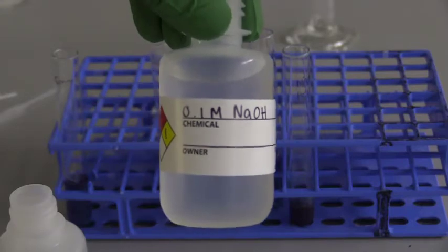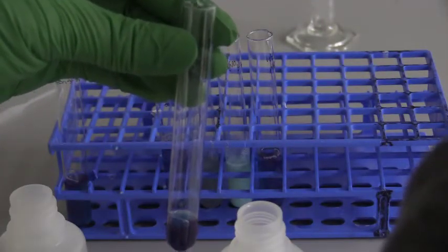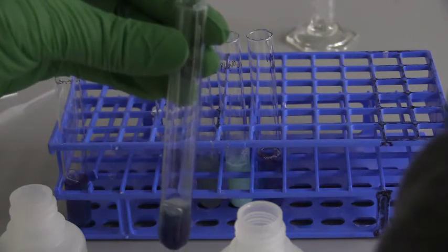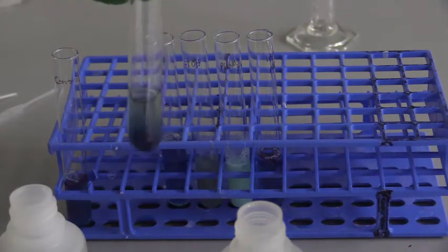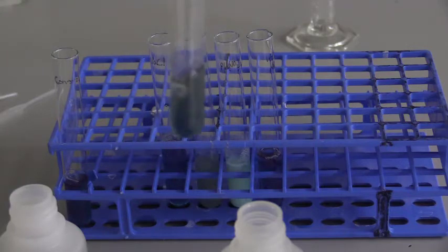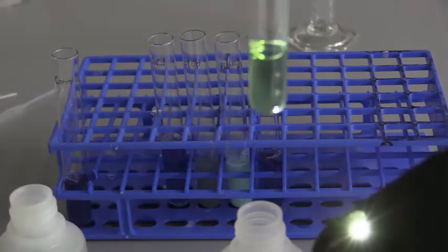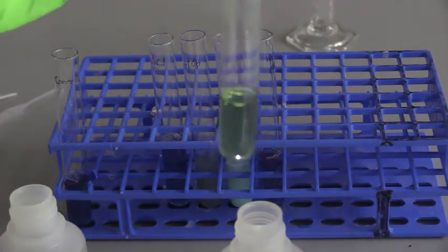Okay, next we're going to add sodium hydroxide, 1 milliliter. You can note your observations here. Is there a color change, a texture change? And here's the sample with the light shined on it. Record your observations.